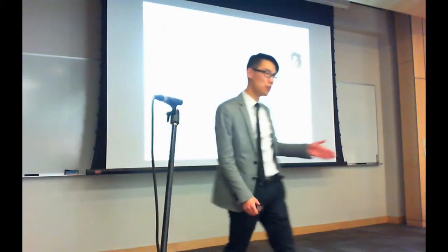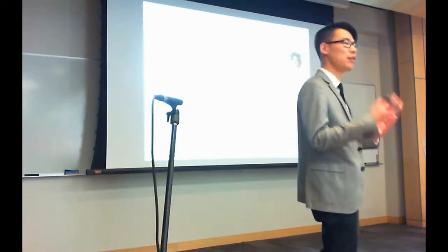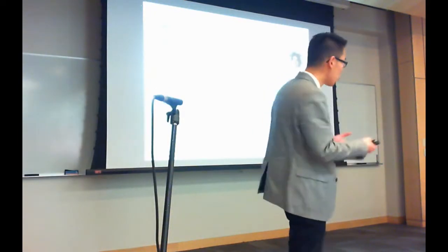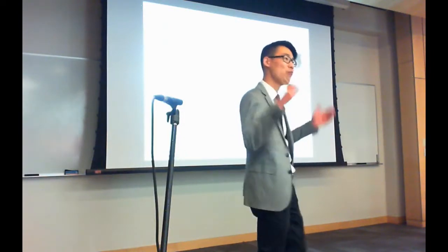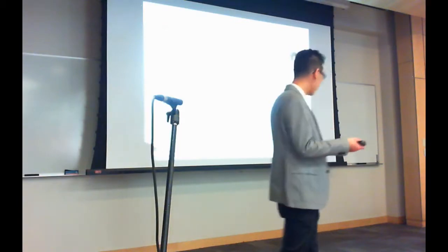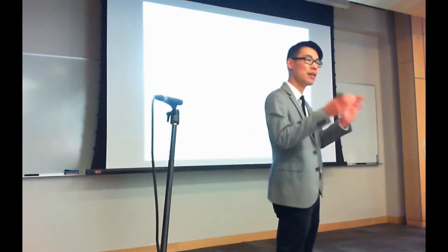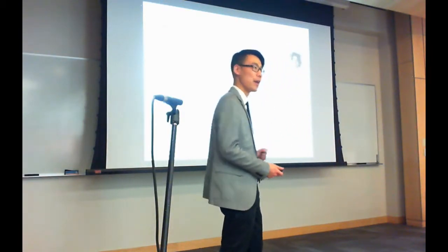And once you have this distribution, you can ask the question, well, if I have a new query that matches the library, how reasonable does it look as a replicate spectrum? And if it's a low score, we're like, oh man, we wouldn't expect a replicate to look like this very often. And so we can calculate a significance for that match.